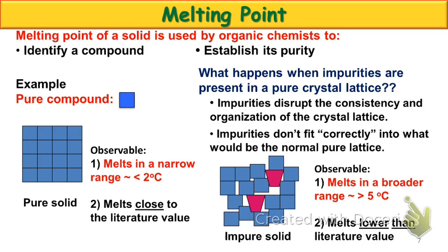When we look at a melting point, however, do we see a volume change? No. So do we expect to see much of a pressure change or a pressure dependence? Also no. Okay? Why is that nice? Well, if I take that compound and melt it here, and then I go to Denver and melt that exact same compound, what's my melting point going to be? The same. Okay? So we can look up and identify compounds based on their melting points.